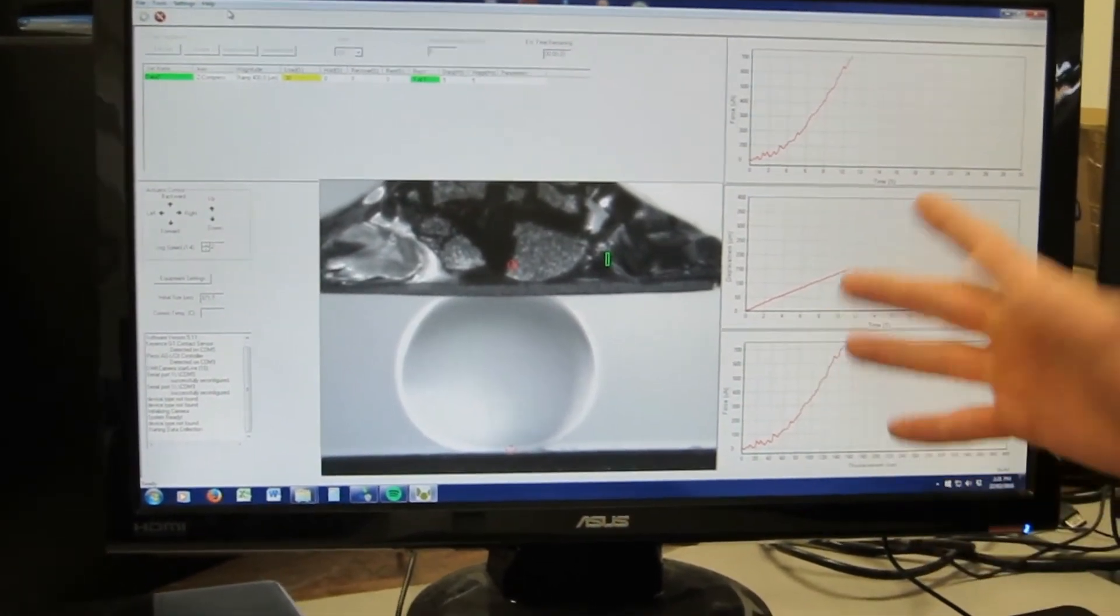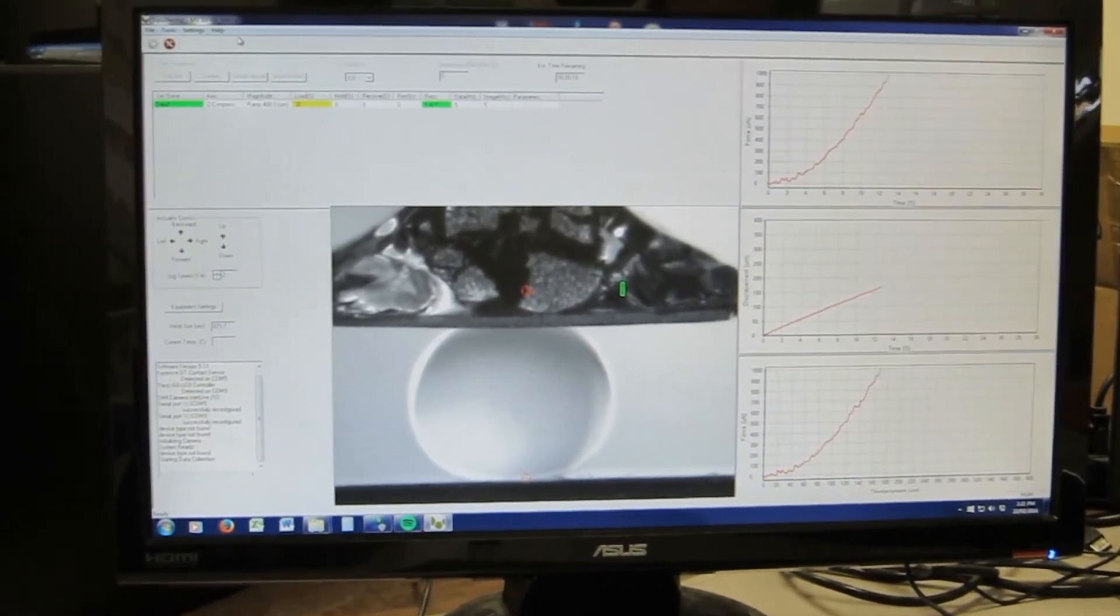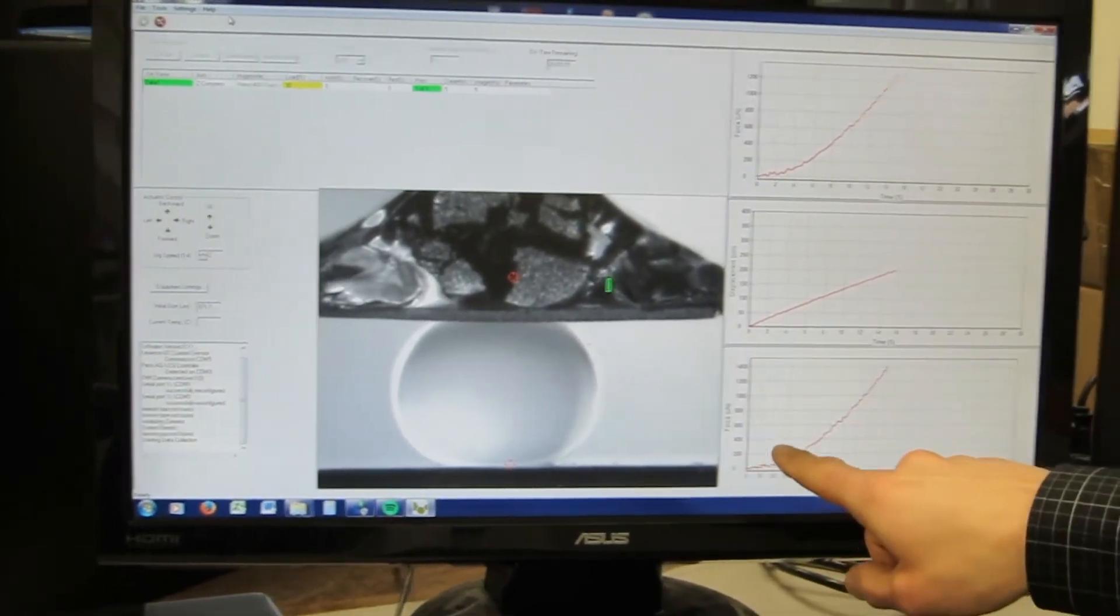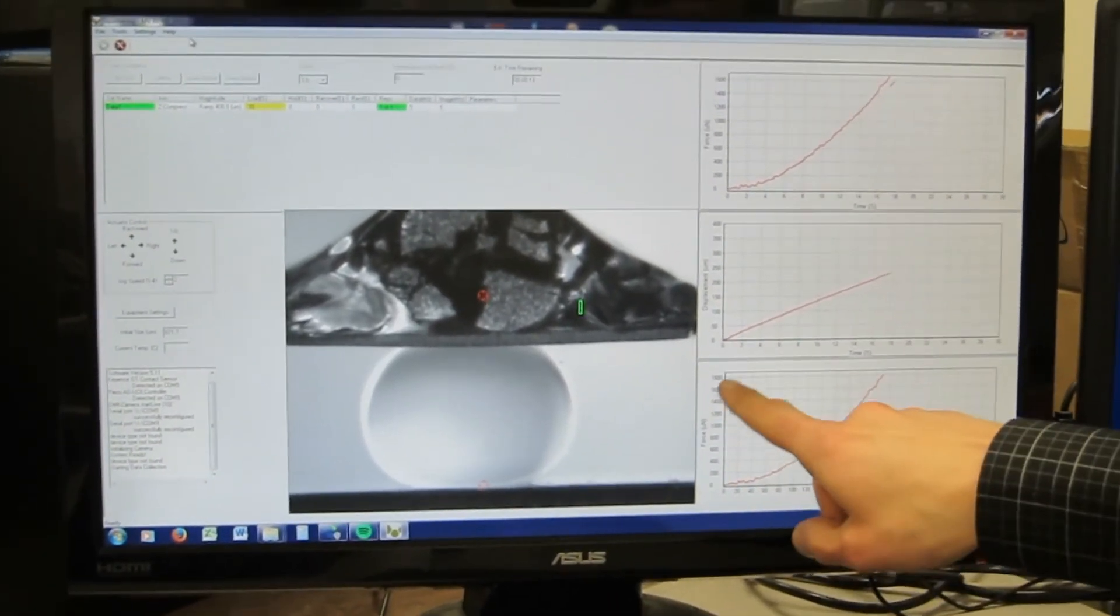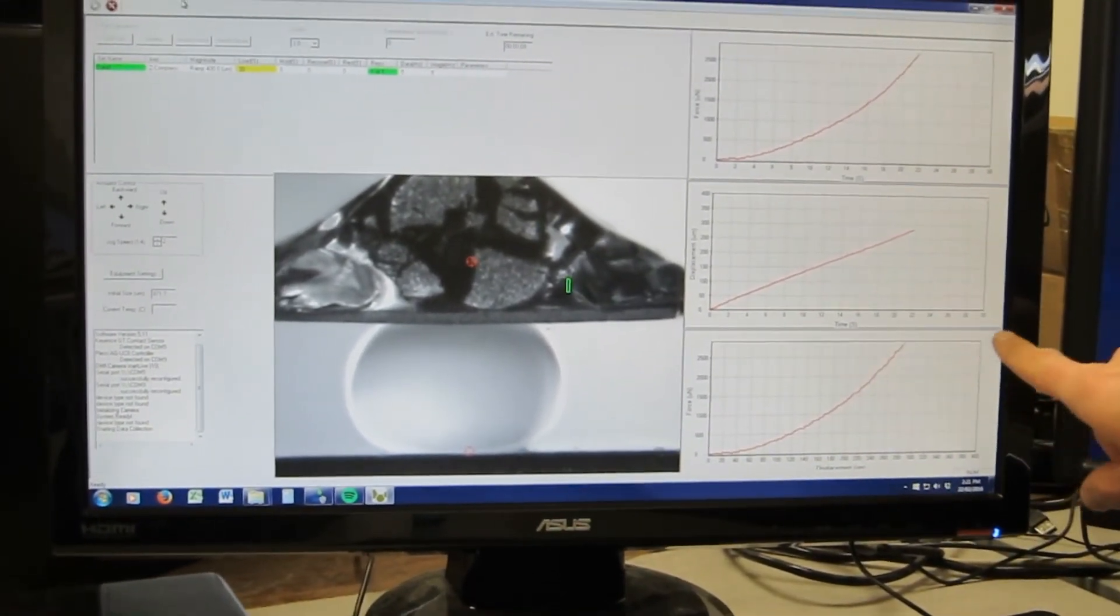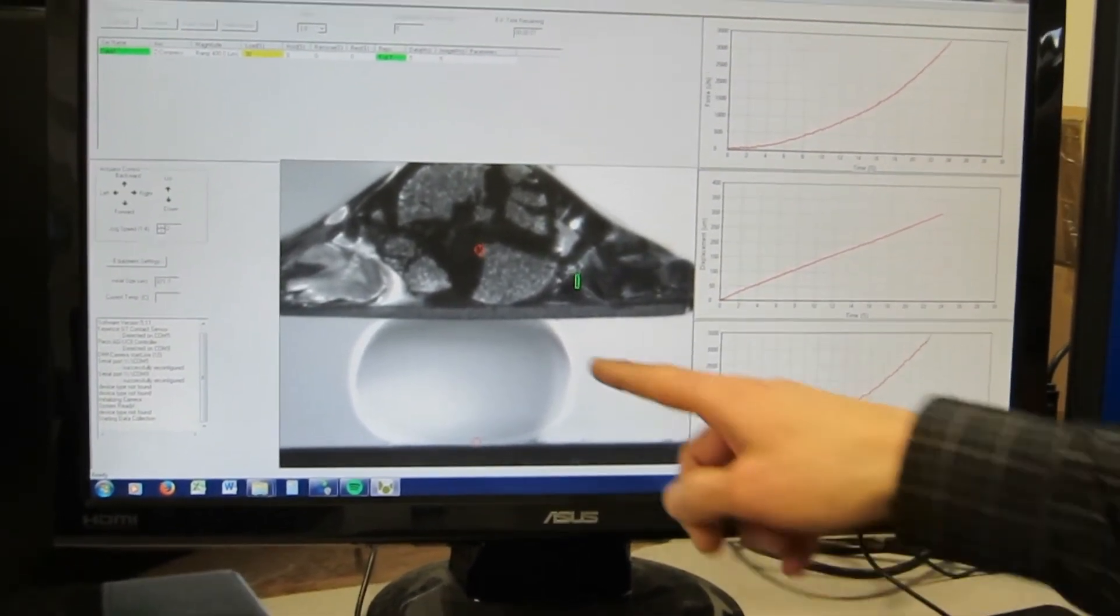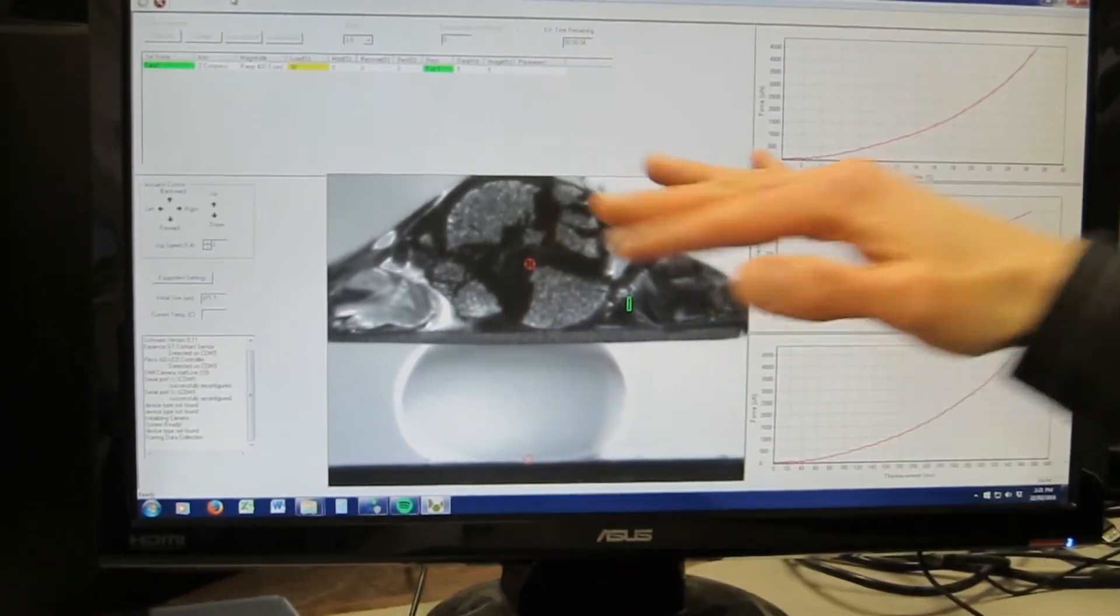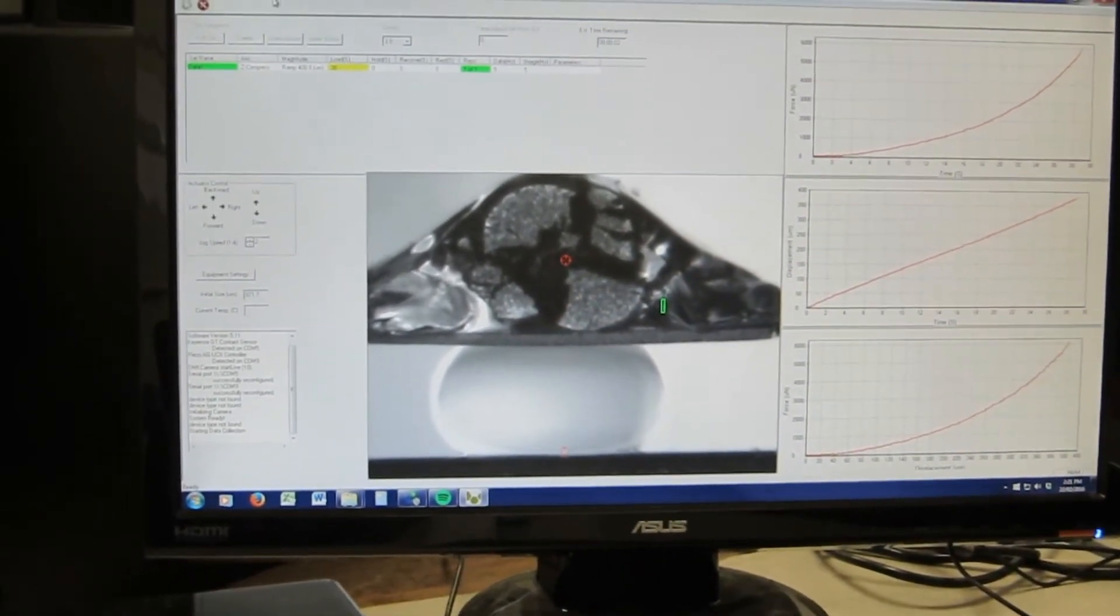This is a relatively large microsphere so we're expecting forces into the millinewton range and that's what we're getting. We're hitting about two millinewtons there now. Coming up on three millinewtons and you see that the sphere, what was a round sphere now has the flattened surfaces due to the compression.